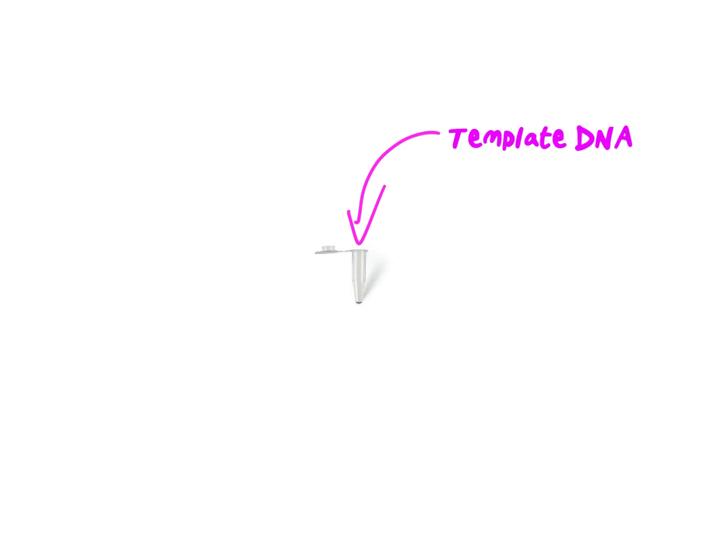So to summarize, we have our PCR tube. Into our PCR tube, we will have our template DNA. Now that could be a cell. If you're looking, in forensics, you might be looking at cells for target DNA, and I will explain that when I talk about DNA profiling. It might be a section of DNA that you've cut out of something using restriction enzymes. It might be, if you're having a COVID test, just the saliva that will potentially contain the COVID virus. That's the template DNA. So that goes into the tube. Also into the tube, we'll be placing Taq polymerase.